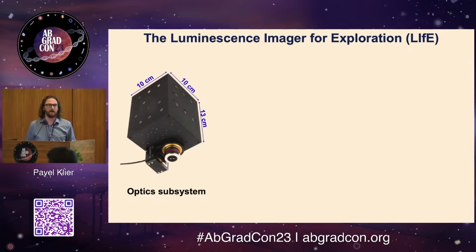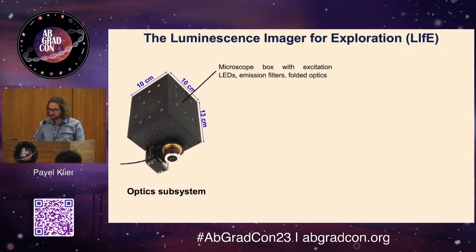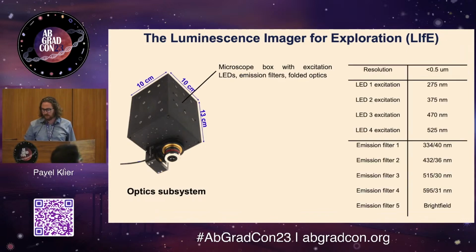Fancier microscopes can sometimes be the size of a person if you're trying to do crazy 2-photon lifetime imaging or something. But even an epifluorescence scope would probably occupy this podium normally, and there'd be a lot of miscellaneous assorted parts. So it's a really nice little system, and it contains all of the excitation LEDs, emission filters, and all the optics.